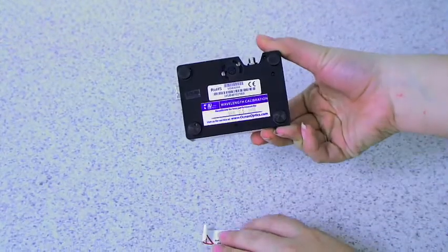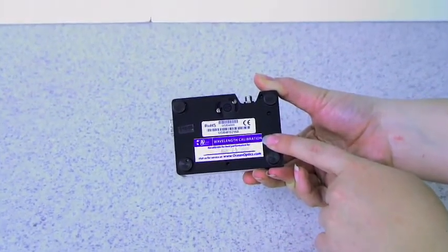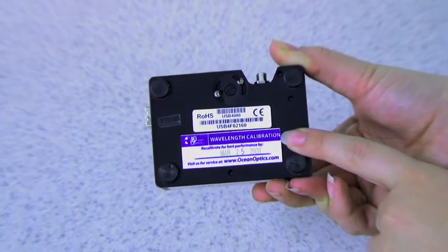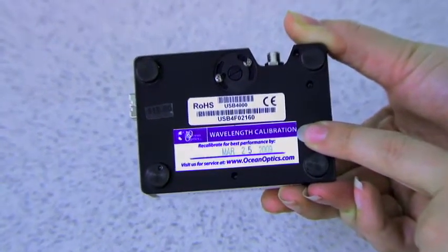If you flip your Spectrometer over, you'll find its serial number, its RoHS and CE compliance marks, and a recommended date for your next wavelength calibration.